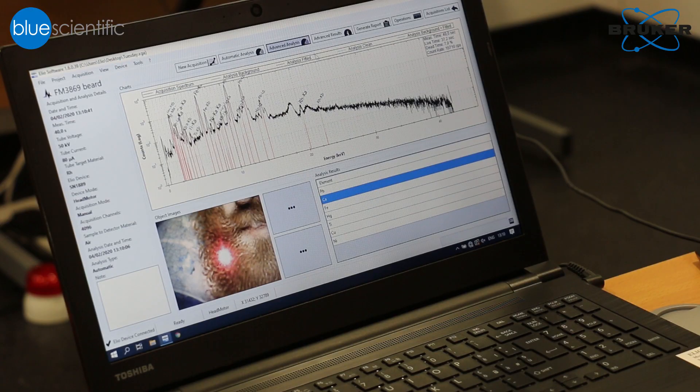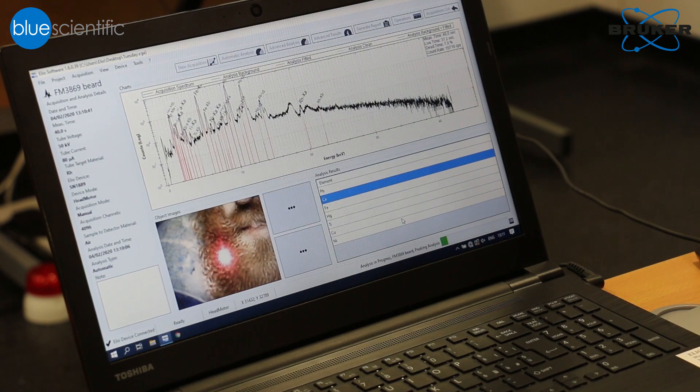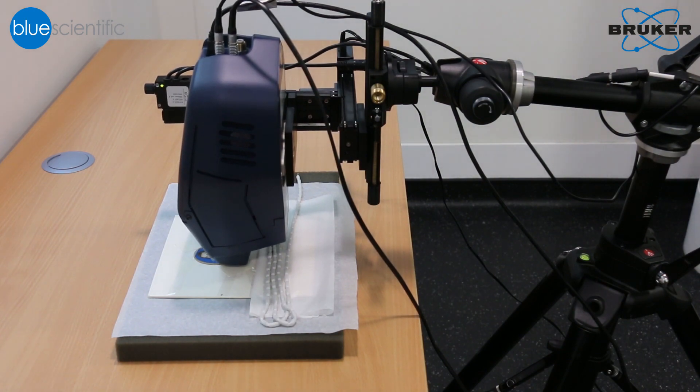Getting elemental maps really helps, especially in cases like the one we're investigating now, where the original composition was slightly modified at a later time because the pigments degraded and the miniature was damaged. We have successive layers of pigments, and it's really difficult to sometimes isolate these layers if you don't have a map to guide your investigation. We're really fortunate to be able to use this instrument in this instance, because our own XRF instrument only does point analysis — we can analyse single points but not get the maps, which are so helpful in finding out what the composition really is across the whole miniature.